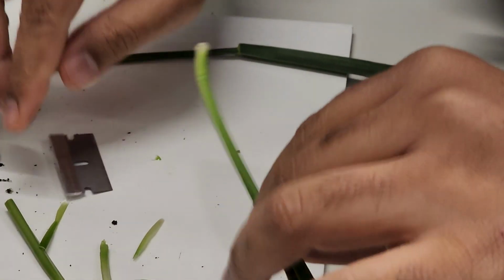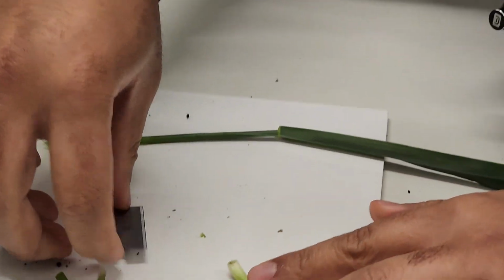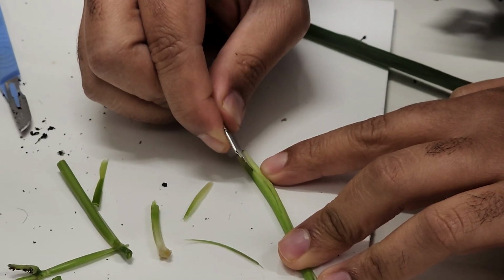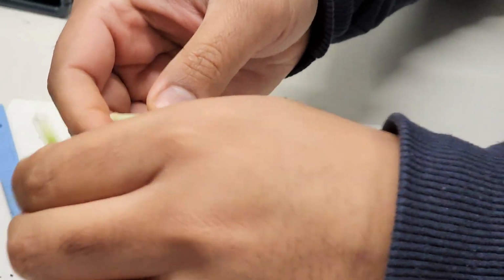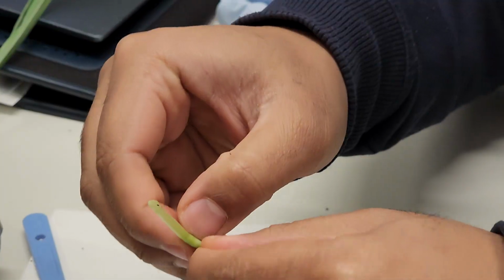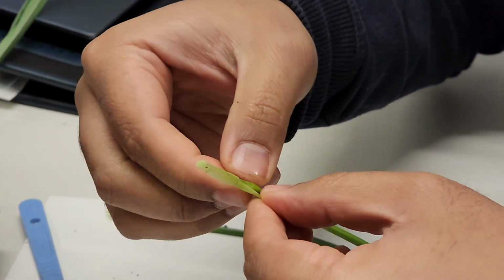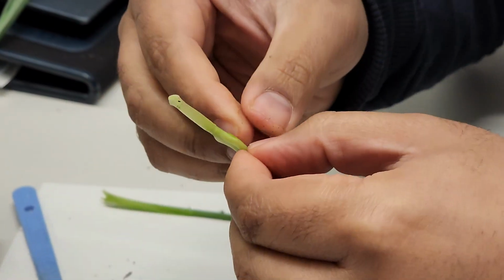Okay. Let's open this. So you need to pry it open. Ooh, somebody in there. Yeah, I think that's the meristem. Wait.